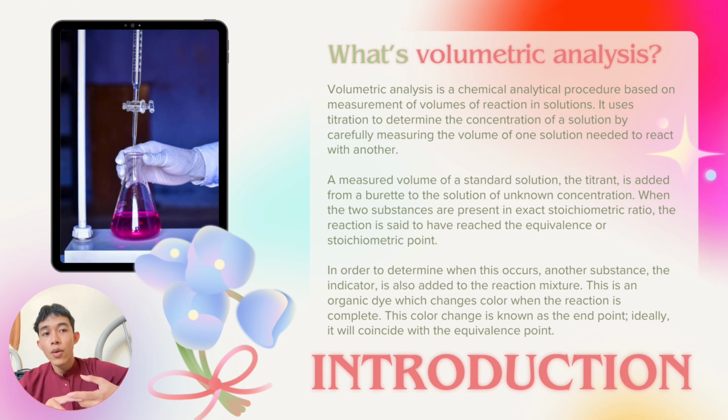In order to determine when this occurs, another substance, the indicator, is also added to the reaction mixture. This is an organic dye which changes color when the reaction is complete. This color change is known as the endpoint. Ideally, it will coincide with the equivalence point.